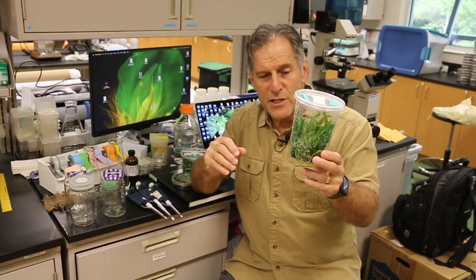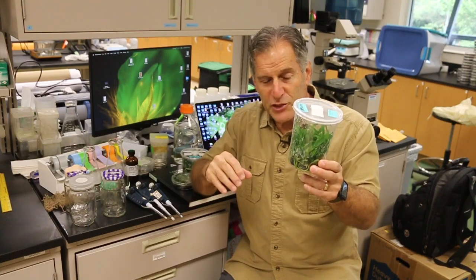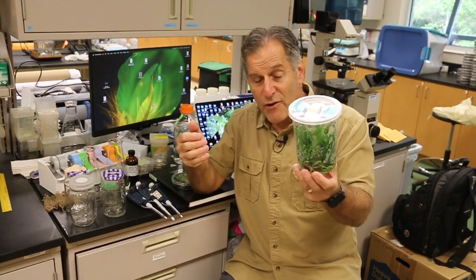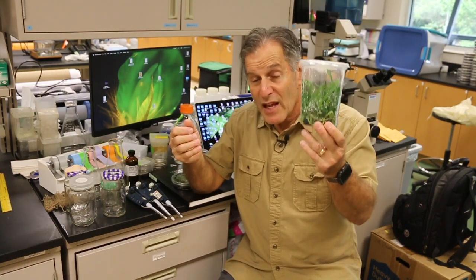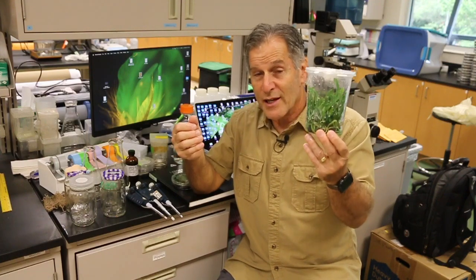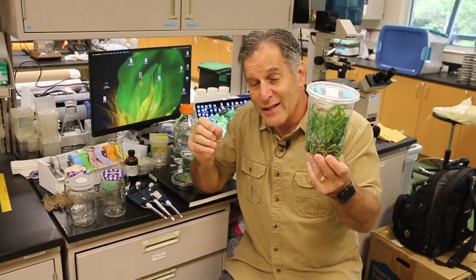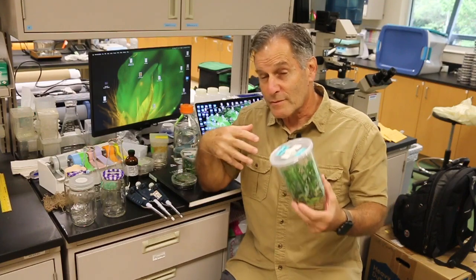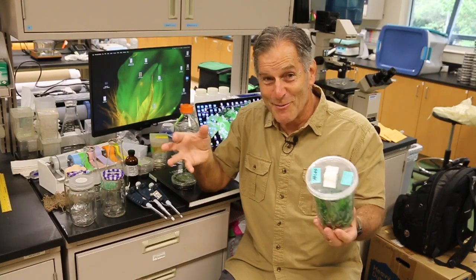The benefit is that the bigger plants are going to do really well upon deflasking, and it also shortens the flowering time, which is beneficial. So again, you can see flowering as early as a year and a half to 2 years after deflasking, if the plants get big like this. And if you can accelerate the growth of these plants early on, I think it's beneficial to get flowering and then get more generations in over the time that we have.